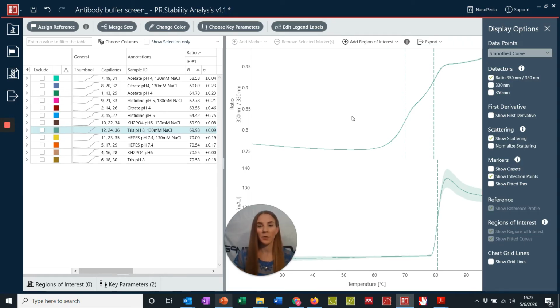First, you have the option to directly export either the charts or the data table from the software. So again, meeting your specific analysis needs, once you're satisfied with the various display options that you've chosen and you'd like to export these charts for your analysis, you can simply click on the export option located directly above the charts, and you can see that you have two options: to either export the chart as a PNG image or to export the chart as vector graphics.